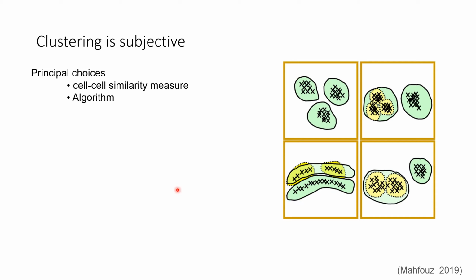So, some of the principal choices. As I mentioned yesterday, very briefly in the chat, the Euclidean distance metric that quantifies the distance between two cells in gene expression space is potentially problematic because it more heavily weighs genes that have higher expression values, just by virtue of those genes contributing larger numbers to the distance matrix. And this doesn't necessarily sit well with people because whether the magnitude of mRNA abundance maps to differences in cell physiology is not well established.